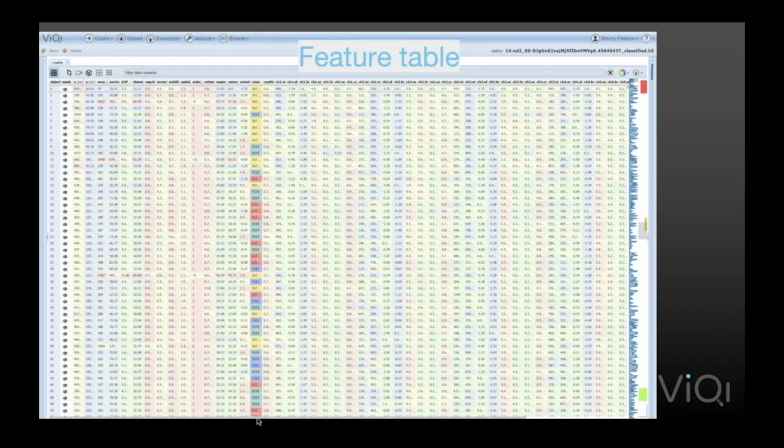The feature-based AIs, they don't care what this numerical content is. This could be categories or floating point numbers or whatever you want, and it doesn't care how many columns you have either. So really the AI's task at this point has nothing to do with images. It's simply using all of the columns here, but all of the columns other than the class, to predict what the class column would be. And you can actually set the AI to be that general. So given a table, here's the class column, and use all the other columns to predict the class. And AI systems that are fairly automated would go ahead and do that.